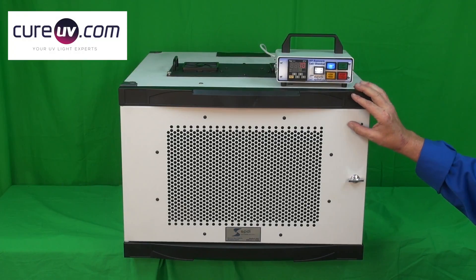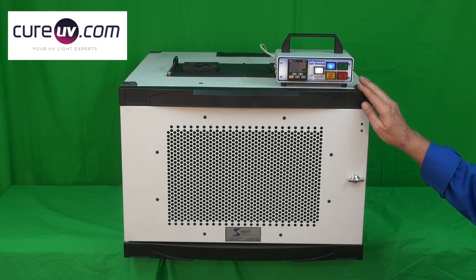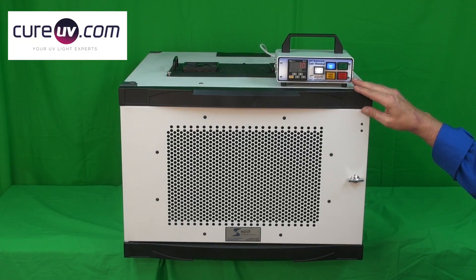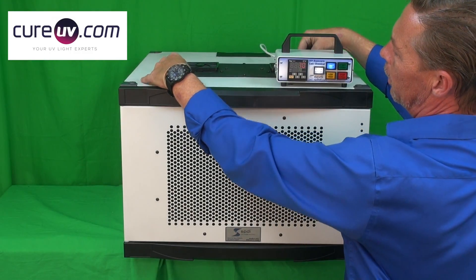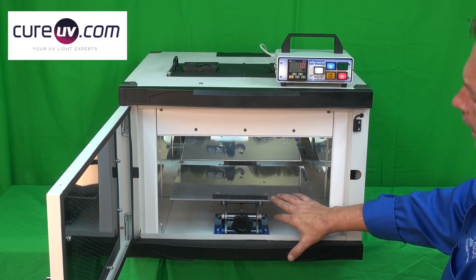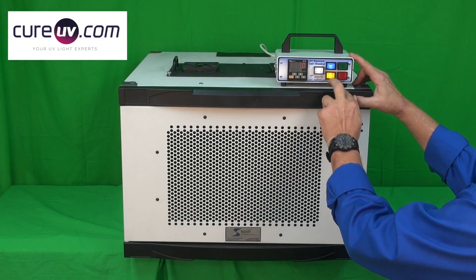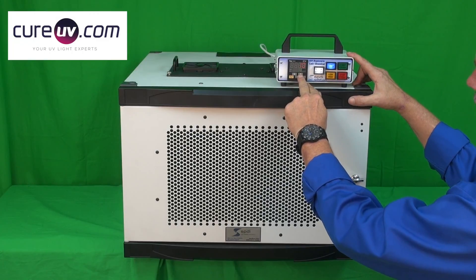Economical, practical, and scientific — all in one clean package that's easy to operate, duplicate, and replicate any type of UV testing or process development. With an easy method to change your lamp output from UVA to UVB, and an economical yet scientifically repeatable intensity control, with low or high intensity output controllable down to the second of UV exposure.